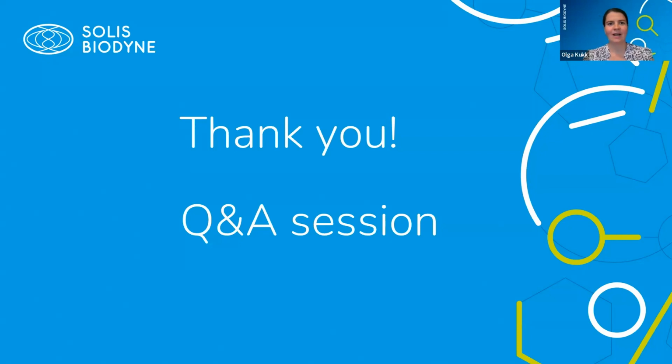Exactly. Thank you. And then I see we have a follow-up question regarding your comment on carryover contamination. An anonymous attendee is asking, can you comment on the difference between a PCR primer and just a sequencing primer?